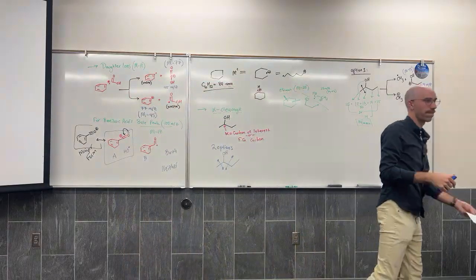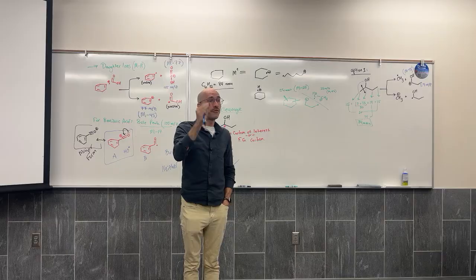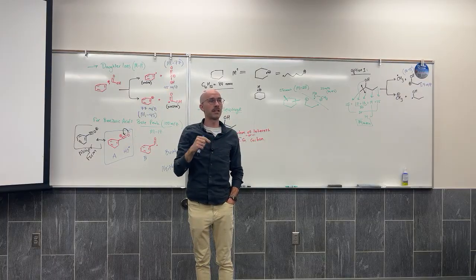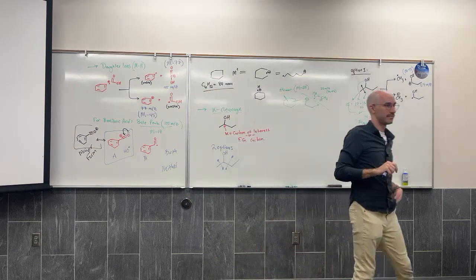Why wouldn't the molecular ion appear on this? What it's saying is that the molecular ion just doesn't form very often, or if it does form, it fragments. Okay. And it's just not an abundantly forming fragment. So it exists, but we can always tell by adding the mass of the entire molecule.